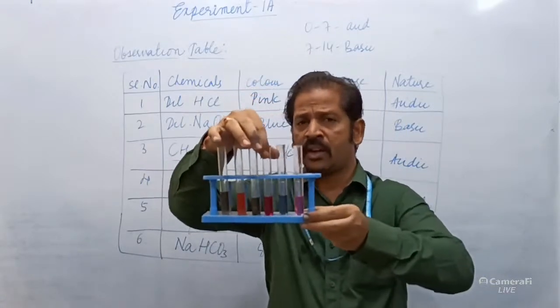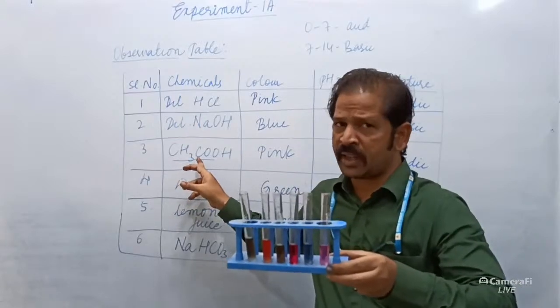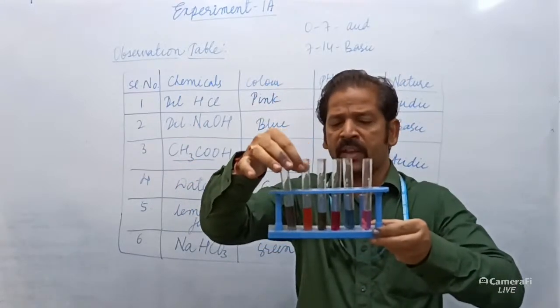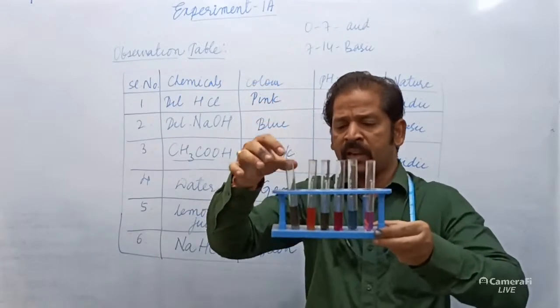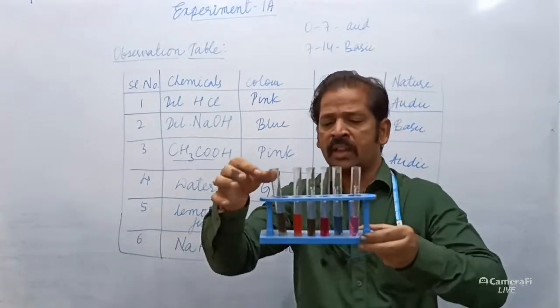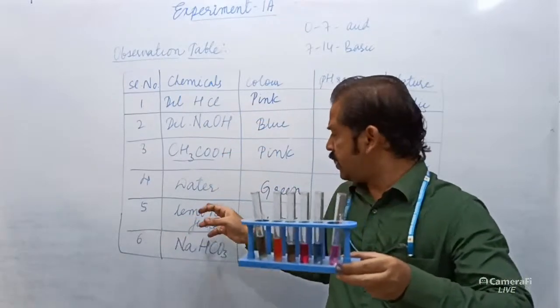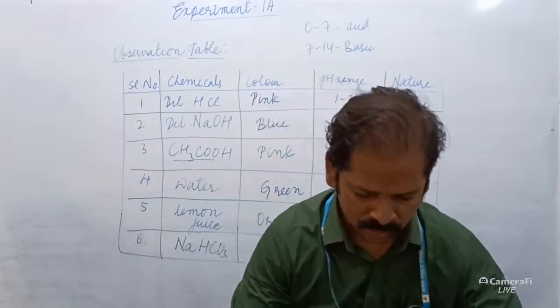The third one is acetic acid, strong glacial acetic acid. The fourth one is water. The fifth chemical is lemon juice, and the last chemical is sodium bicarbonate solution.